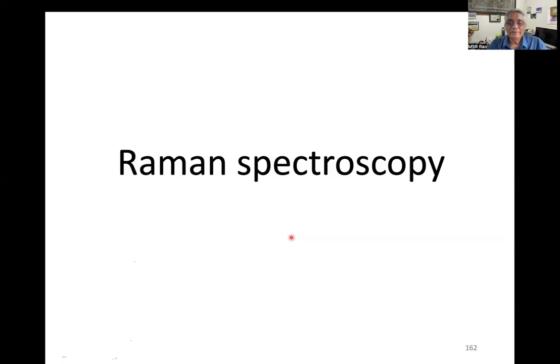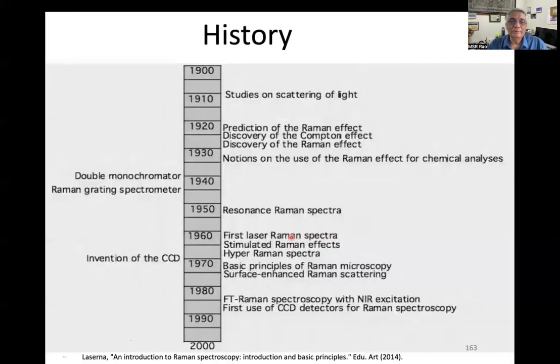It's a non-invasive technique. You don't have to give physical contacts like that you need to do in the case of electrical property measurement. And its versatility today is beyond imagination.